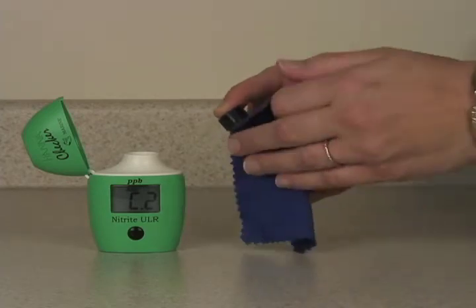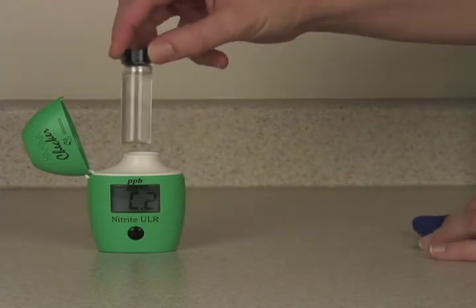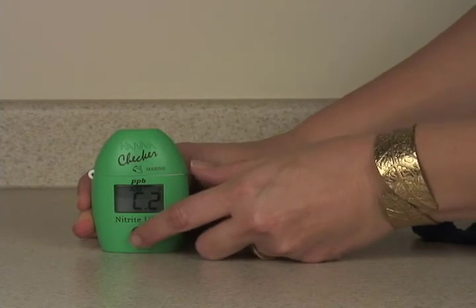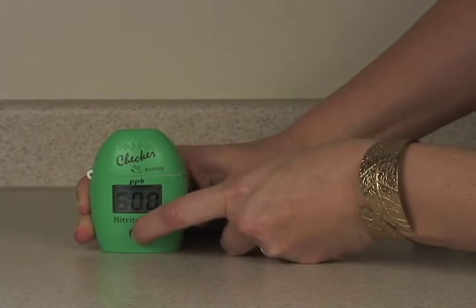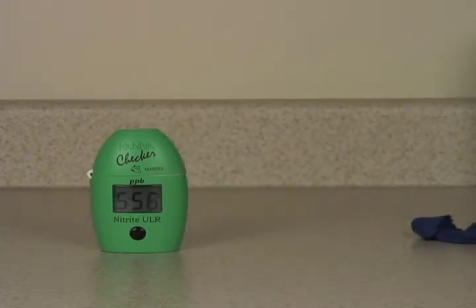I'm going to take our lint-free cloth and just wipe off any smudges or fingerprints I might have put on there. Put it back in the meter and press and hold the button to activate the timer function. The meter will now count down a six-minute reaction time before taking your reading.